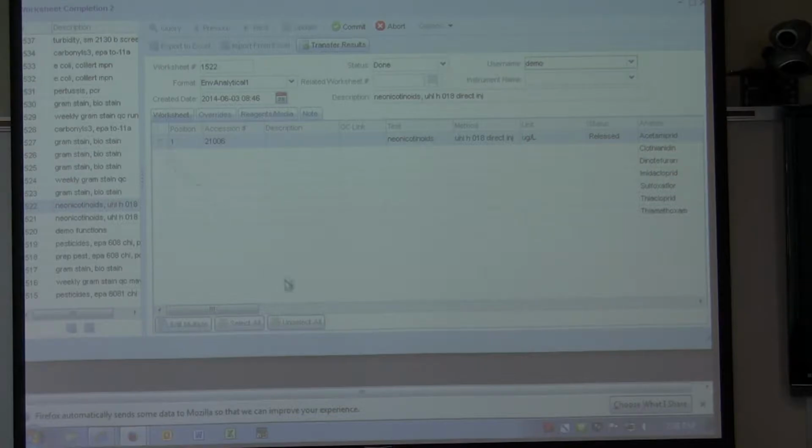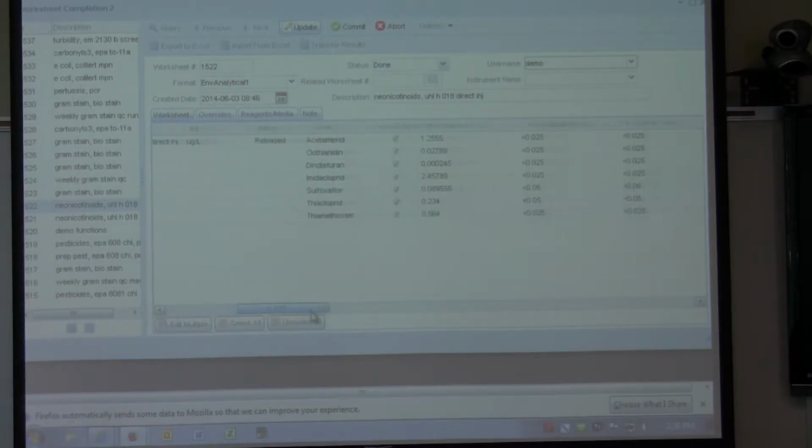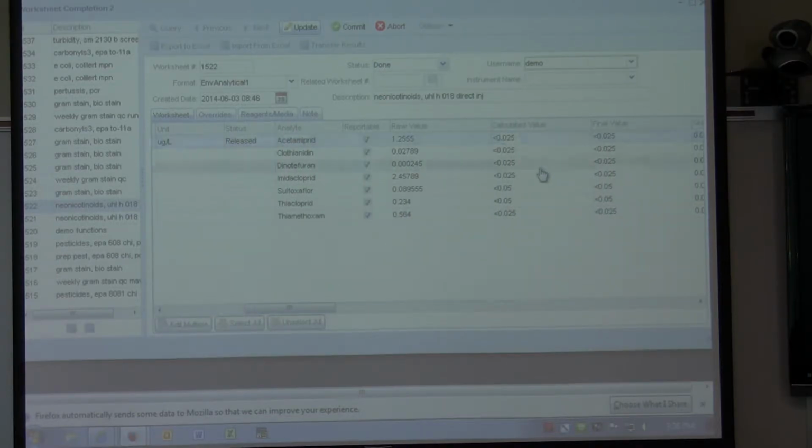It won't check. I want it to also click transfer results. I just wanted to see what it'll do. It's already in transfer results mode. Also, if you wanted to update it as well, I wouldn't let you mess with anything. It's released.